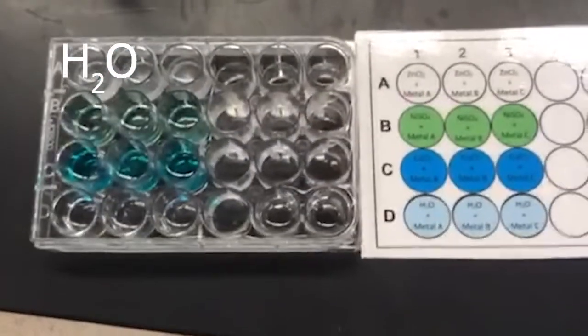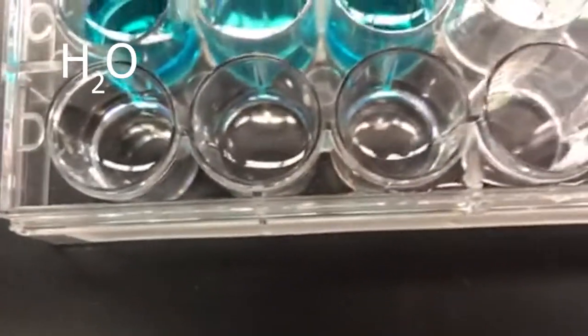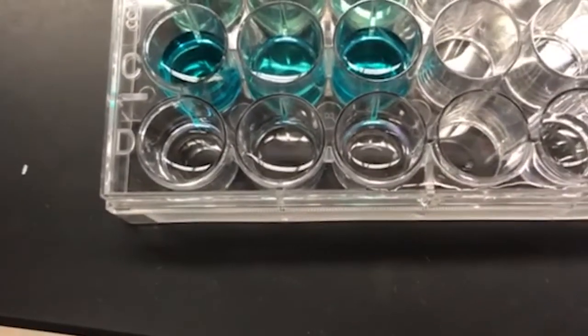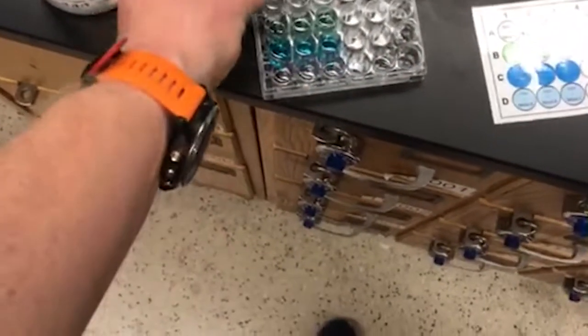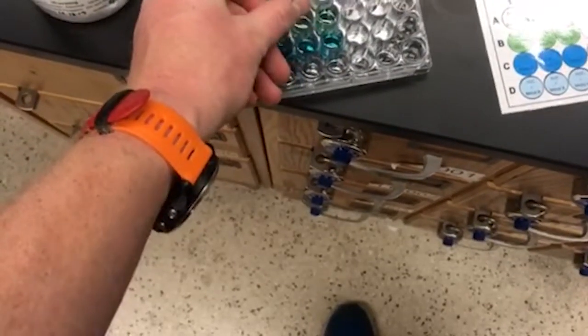The last solution that I needed to get for my plate was water. So I've added water to D1, D2, D3. That's going to serve as a control, a negative control, in fact. I have my 4 pieces of my metal A. I'm going to drop into each one of these solutions.